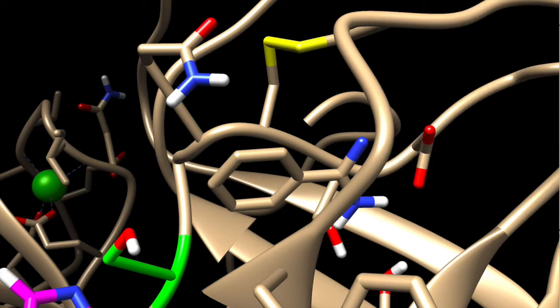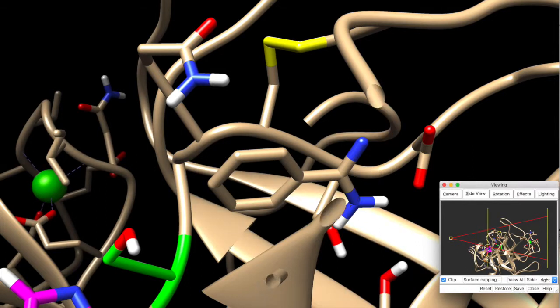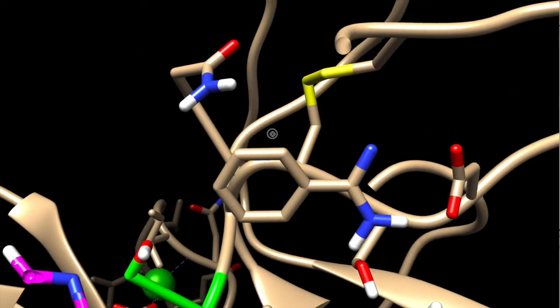And what I want to do, I want to get rid of this front piece. So I will use this interface to clip that. I cannot clip this too much. Okay. Once I'm happy with it, I can add this in. Very good.